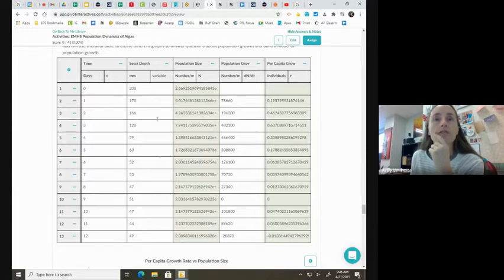Okay. And then they subtracted, and I'm not going to lie, I can't get the numbers they're getting. So I redid all of this with my own numbers, but let me show you. I think they did it based on the slope of the line, and they calculated slope for each point, and I'm not about that life. So I just took these three dots right here, this population size. You might want to watch this because it might make your life easier, unless you love scientific notation where you can't see what that E plus is.